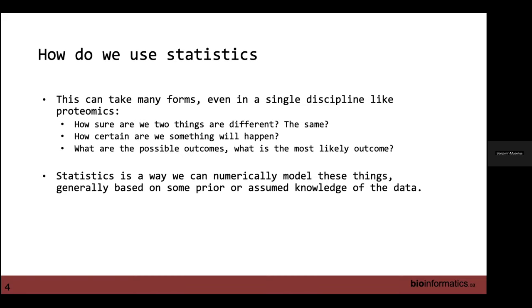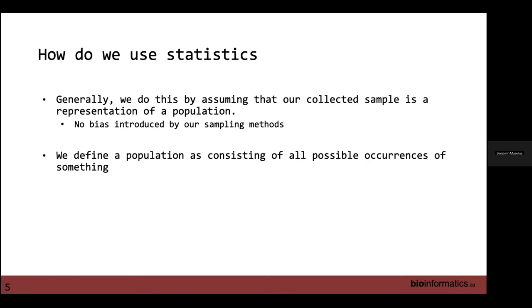Very cool. So what I've set up is I want to go through some of the underpinnings of statistics. So how do we get from people who are very number crunchy doing distributional theory and things like that to us using it in statistics for biological sided problems? And I think it's important, at least on the biology side, even if it's not something we do every day, to understand where the methods we use come from, because that then allows us to troubleshoot those methods. And if something goes wrong or something looks wrong, either in our own analysis or a colleague's, figure out what might be happening.